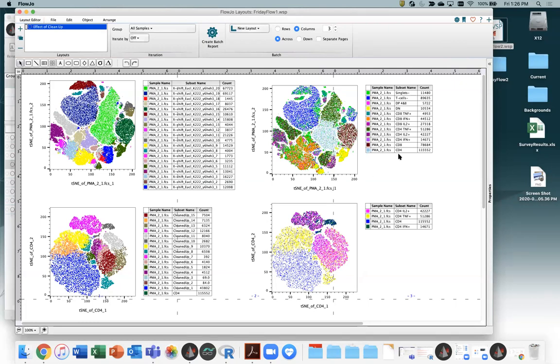In this next plot, I've used the color to indicate different populations I did just by hand gating, in rough hand gating terms. So again, it looks fine, doesn't seem obviously terrible, but the first thing I want to point out is I made this neon green population the not of my singlets gate. And just notice how those neon green cells are spread through pretty much every one of these clusters. So just to remind everybody that doublets can look like any kind of cell and sneak into your data and really perhaps confound you. So it's really worth taking out those doublets.